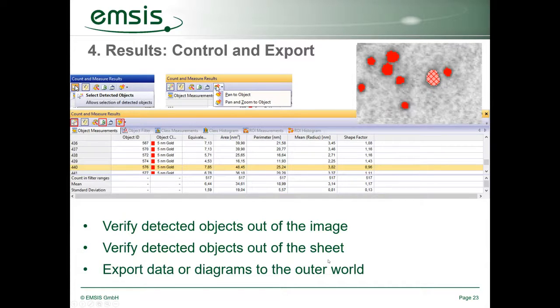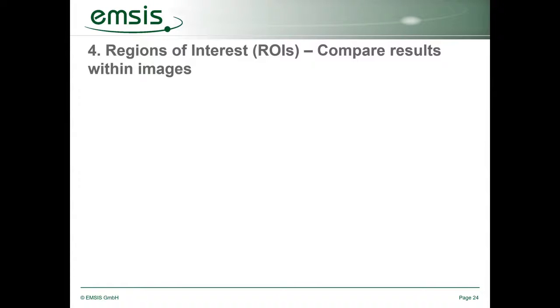If all this is finished, you can use the export button, and you can export the sheet as a CSV file, a comma-separated value file, which gives you a sheet that should be compatible with every kind of statistical software. So I would say this could be fine. You got your results, you have saved them, and everything is fine.